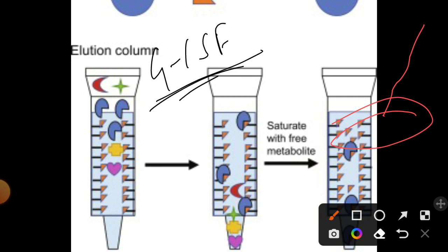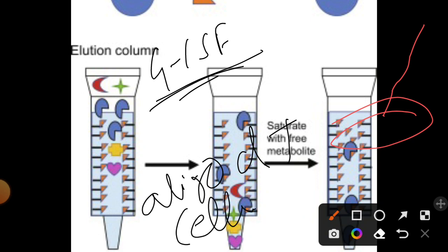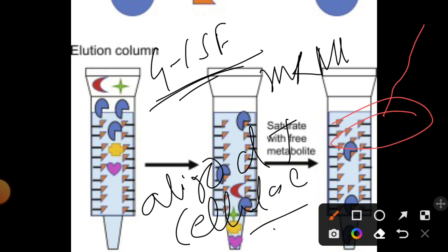I have told you about this in E. coli lac promoter T7 RNA polymerase based vectors. That is the same thing, and it is totally based on the ion exchange chromatography, or sorry, affinity chromatography. Similarly, we are using oligo dT cellulose chromatography. I hope you remember about this. That will help you to separate mRNA from a complex mixture of RNA.